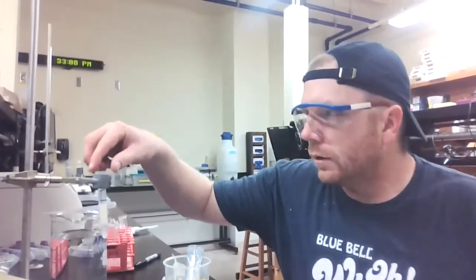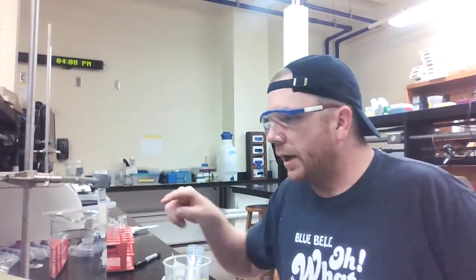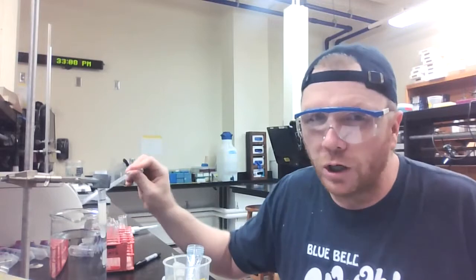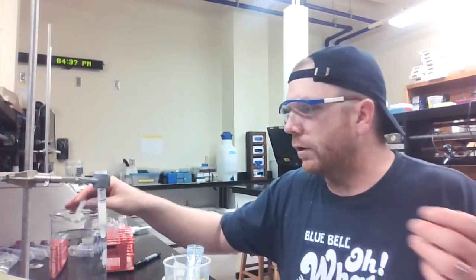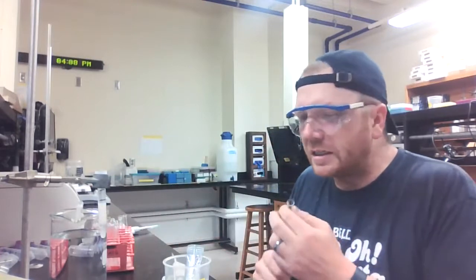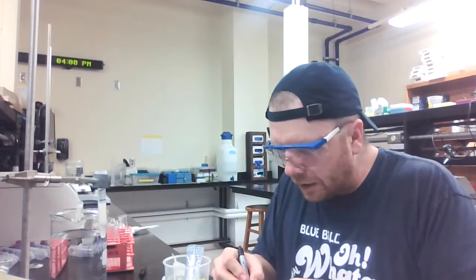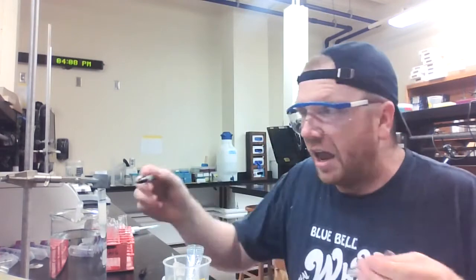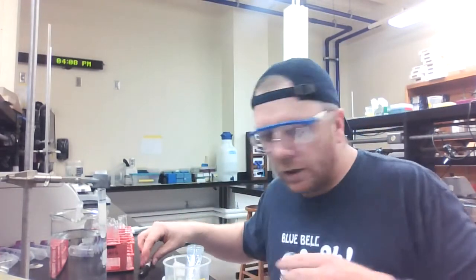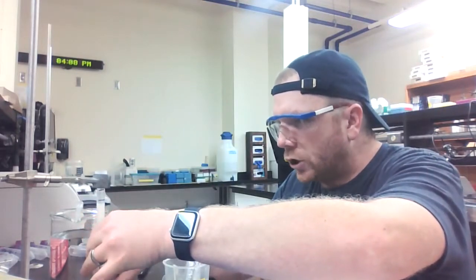If you look at my setup right now, my buffer is all the way to my top line. What I want to do is transition away from using my wash buffer to using my elution buffer. So what I'm going to do is hold what will be my 16th fraction, which I believe will not have any protein in it because I haven't changed my buffer at all. So fractions 14 and 15 are going to be similar to fraction number 16.